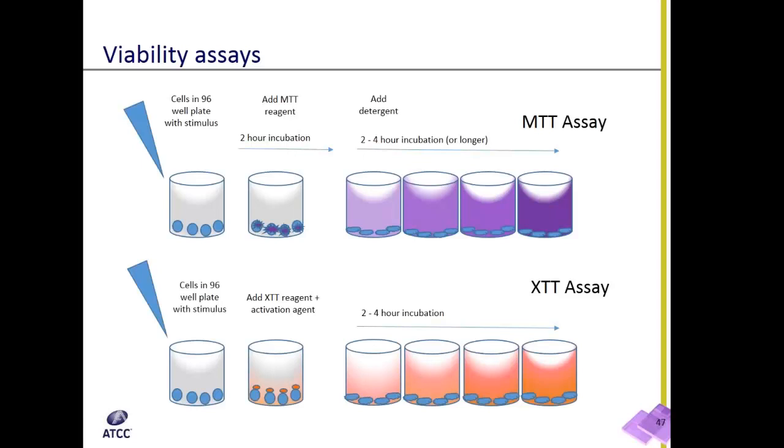And so this diagram here sort of gives you a working idea of what the assay actually looks like in practice. Both assays are designed, idealized, for 96-well plates. And here in this overview, both assays are plated with the cytotoxic test compound. With the MTT reagent at the top, there is an incubation period to allow the reagent to enter the cell. There is a detergent added that allows for the compound to be released into the media. In this case, the cell is lysed.